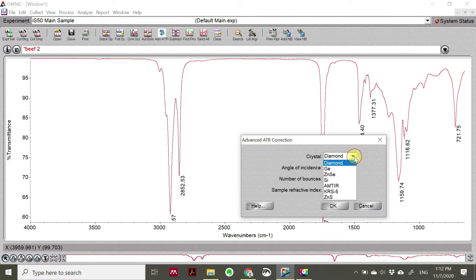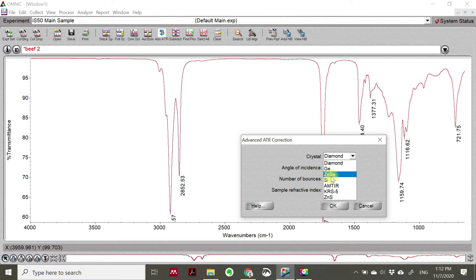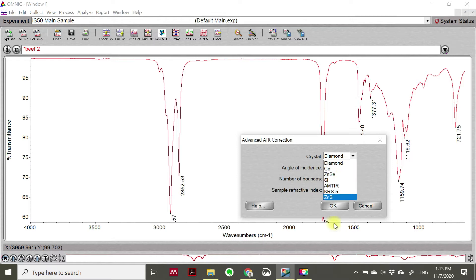Generally, if you have a germanium crystal it's suitable for a sample which is very dark - a black sample such as carbon nanotubes. For zinc selenide crystal, oil samples are also suitable to be used. However, I recommend using diamond because diamond is very hard and doesn't easily get scratched. In my laboratory we purchased the diamond crystal, so that's why we maintain this crystal for our analysis.